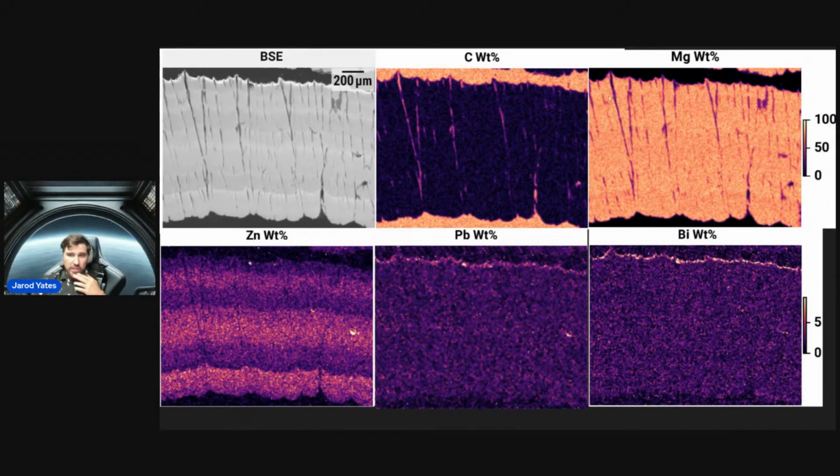I don't know enough whether or not to say for sure that that's accurate. Because we saw some carbonization on the outer edges of the thing, it makes me wonder if these microfractures might have allowed for additional carbonization to occur rather than saying that that is a binding agent. Maybe it is a pollutant like we saw on the edges. Not sure.